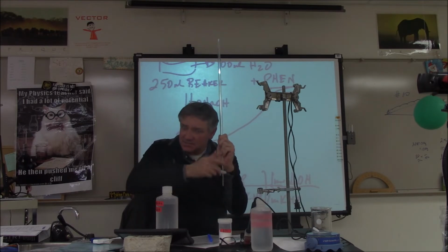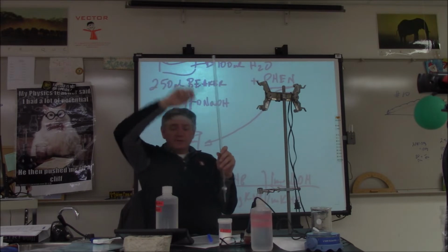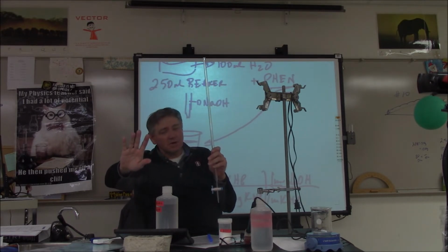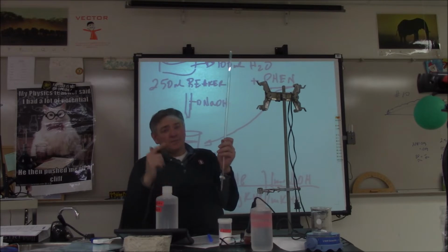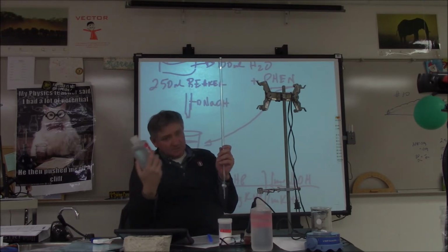But imagine this can turn. You all have imaginations. Imagine this can turn. So what you want to do is run through distilled water. Do not wash this with soap. Okay? Do not wash this with soap. Just rinse it through with some distilled water. Then, when you get done with that, you actually want to rinse it with some sodium hydroxide.